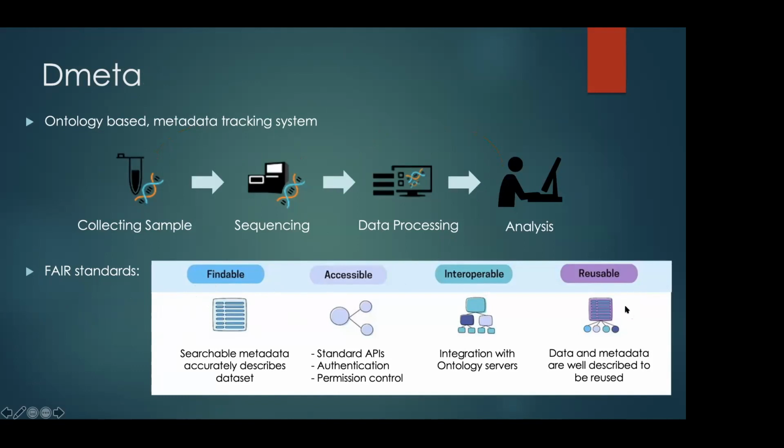So when you are looking for a data processing system to share your results with a large community, you have to check if they support FAIR standards. This means that when you need to access any data in your database, it has to be secure and open to the community, but you cannot give access to everybody.